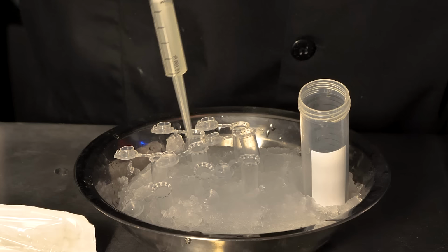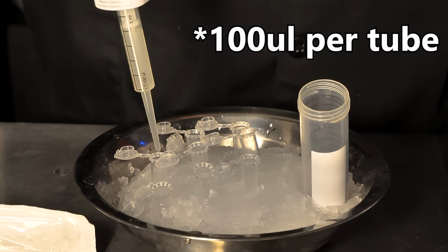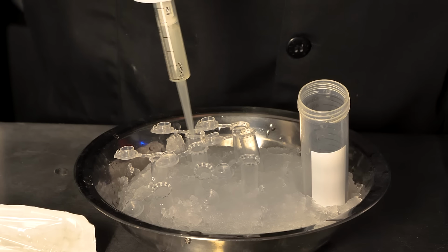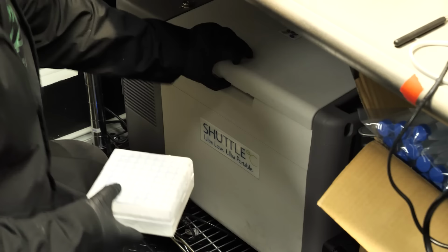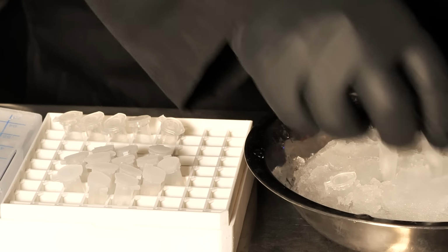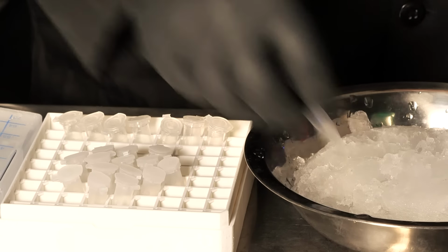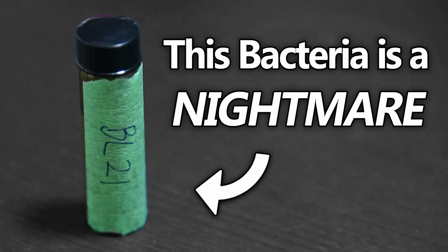Once that's mixed, we're going to aliquot the E. coli slurry 10 microliters at a time into a bunch of tubes. I'm using my fancy repeater pipette to make this fast and save on the carpal tunnel. These can then be quickly frozen in our -80 freezer and are now ready whenever you need them. If you want a protocol that doesn't make nearly as many tubes and only makes a single tube of bacteria, I've put a link to an older video where we go over it.